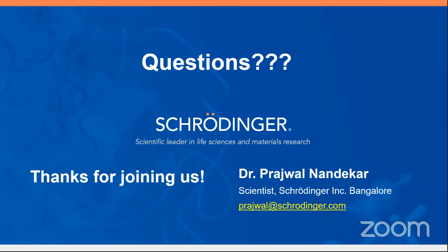The next question is, how to get 2D and 3D protein ligand interaction. For example, the bonds like hydrogen bonds, carbon hydrogen, pi alkyl, pi sulfur, etc. So all types of interactions we will see in the molecular docking analysis tutorial. Just wait for a while. And as I said, you can quickly visualize all types of interactions in 2D and 3D. It is exciting to see all those things. So we will see it in the next lecture.